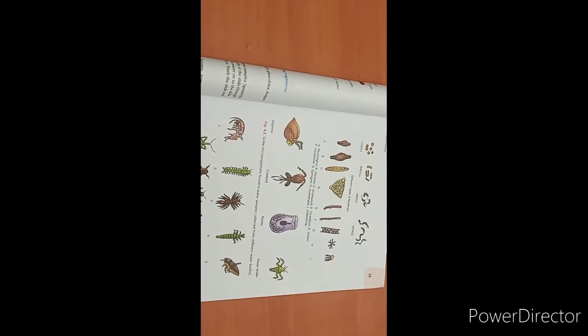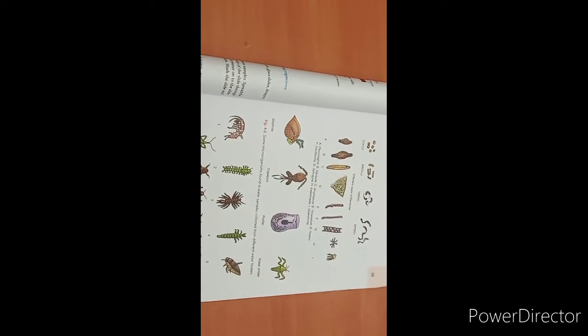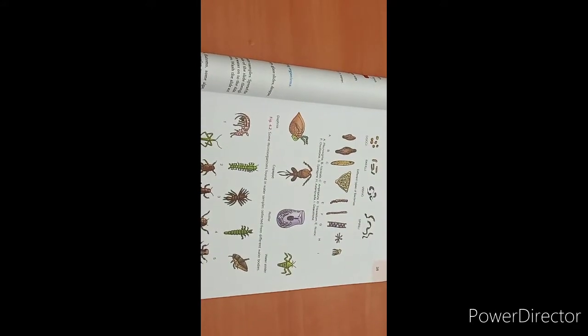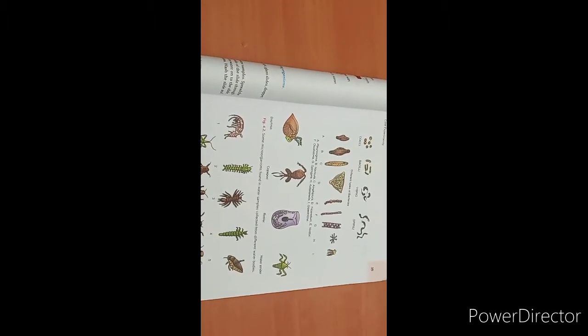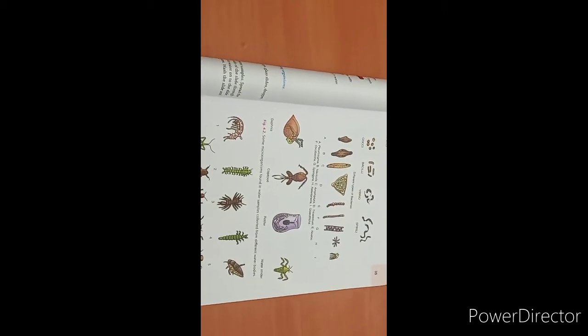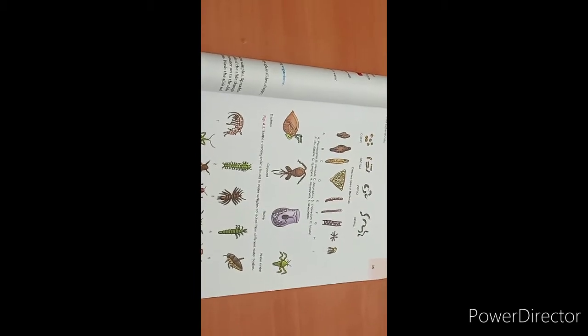And the second thing is that whenever you are taking any particular water by the dropper, it has to be shaken well, and then you have to put it on the slide. And the heating, if you're making a smear of this, should be done only once, not more than that. So I think you must have understood how you are going to perform this particular experiment.